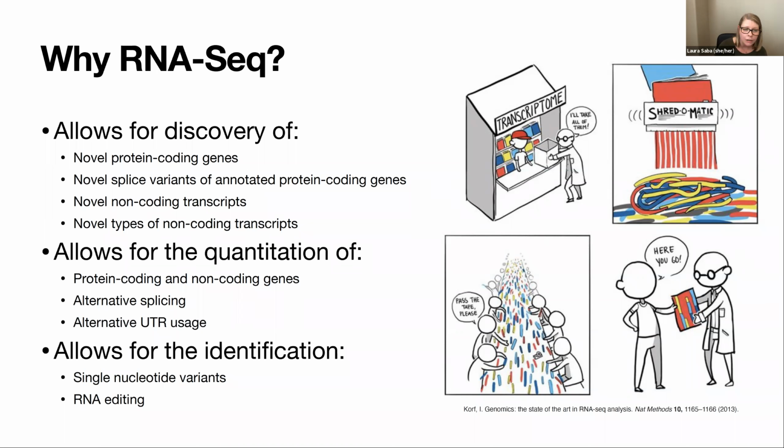So anything from microRNAs to long non-coding RNAs to SNOs to even circular RNAs, and how we can get more data for that full transcriptome, not just the items in the transcriptome that are translated into proteins.